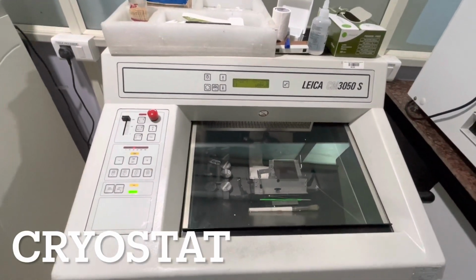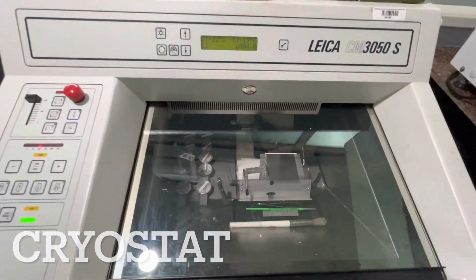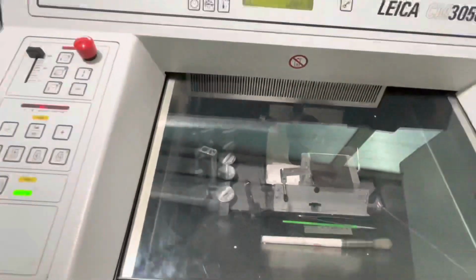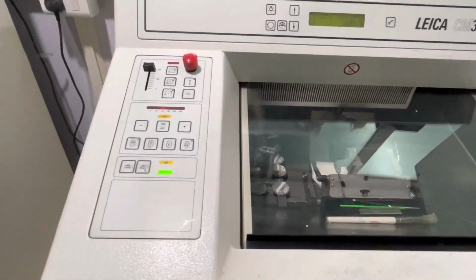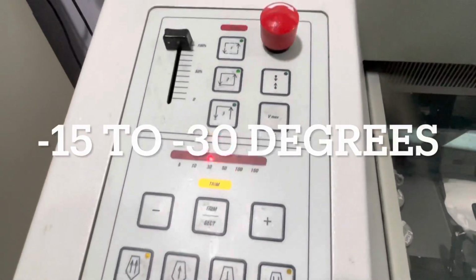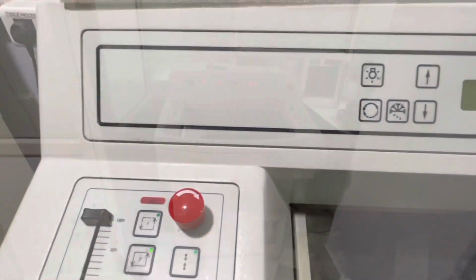This is a cryostat, which is an instrument that is used to freeze the tissue and also to cut the frozen tissue for microscopic section. The rapid freezing of the tissue sample converts the water into ice. The firm ice within the tissue acts as an embedding medium to cut the tissue. The temperature needs to be maintained between -15 to -30.